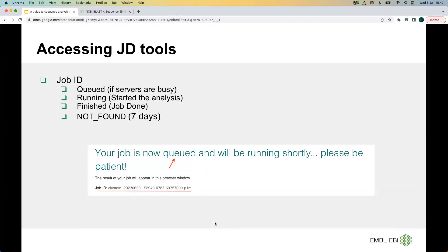Once you submit the job, you will see its status as either queued or running. Queued means that our servers are currently busy and the analysis has not yet started. Running means the analysis has begun and you can expect your results shortly. The status will change to finished once your results are available. If you receive a 'job not found' status, it means the job is no longer stored in our system, usually because it has been over seven days or you provided an invalid job ID.